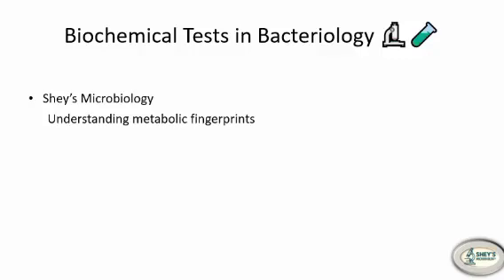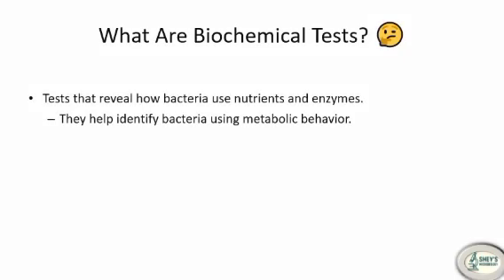Alright, so today on Shey's Microbiology, we are diving into something that really sits at the heart of bacteria identification: biochemical tests. These tests may look simple, but they give us some of the most reliable clues when we are trying to figure out who a bacterium really is. Let's walk through everything slowly and clearly.